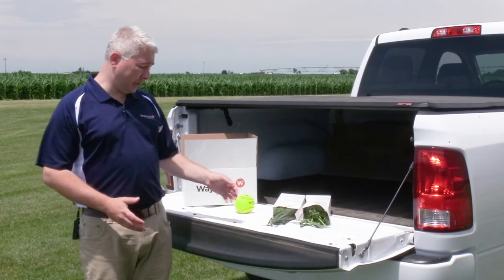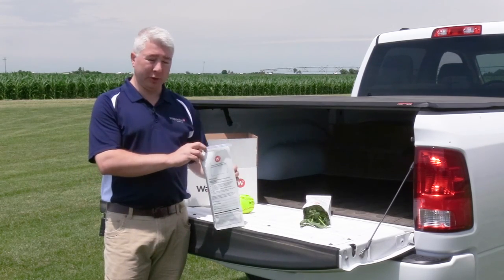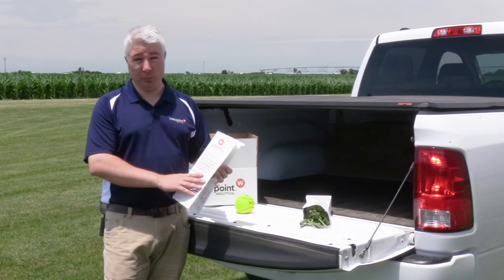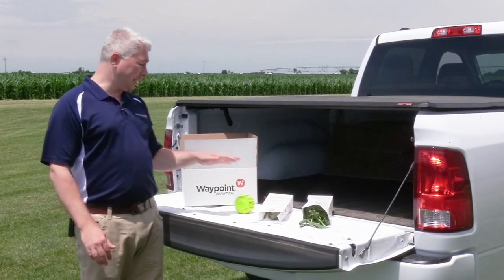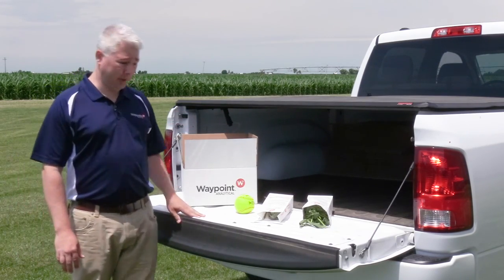So after you've collected the tissue, you want to make sure you put it in a paper bag. Paper is important so the plant can breathe and not collect moisture inside a plastic bag, which would mold. Waypoint can supply tissue bags, boxes, shipping labels, and other supplies to you if necessary.